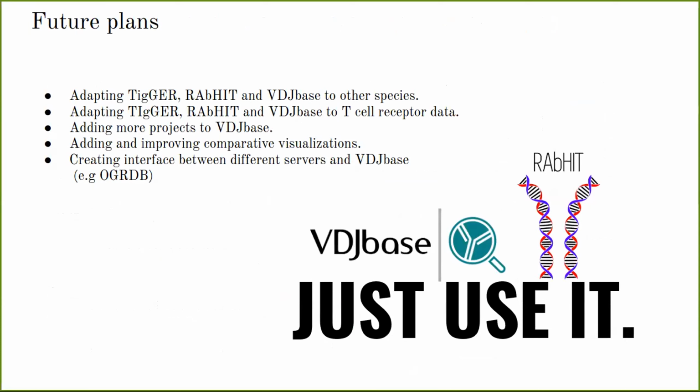Okay, so our future plans are adapting TIgGER, RAbHIT and VDJbase to other species and to T-cell receptor data, adding more projects to VDJbase, adding and improving comparative visualizations, and creating an interface between different servers and VDJbase. And as we like to say, just use it.